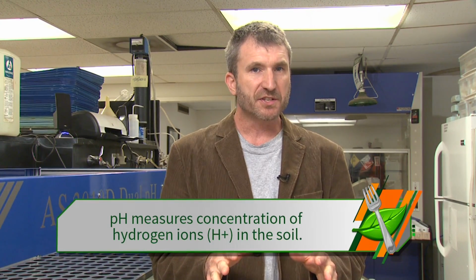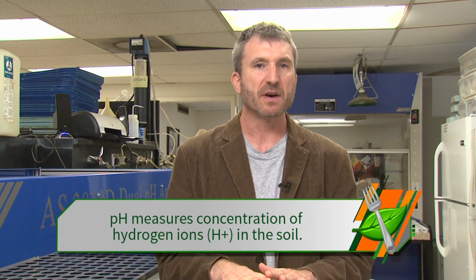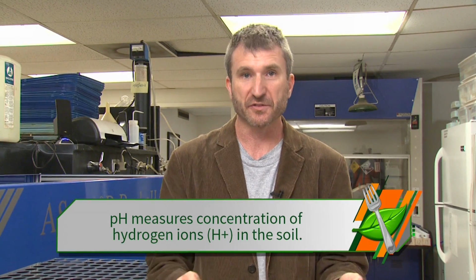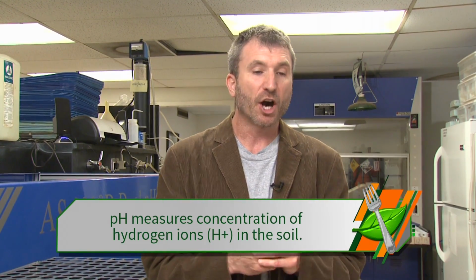Now what is pH? pH basically just measures the concentration of hydrogen ions in the soil. And a good soil is not going to have too many hydrogen ions or too few. There's a range in which there's just enough hydrogen ions to let plants consume nutrients. And so when they send the soil sample here, they want to measure the concentration of hydrogen ions in the soil. And this is the machine that does that.